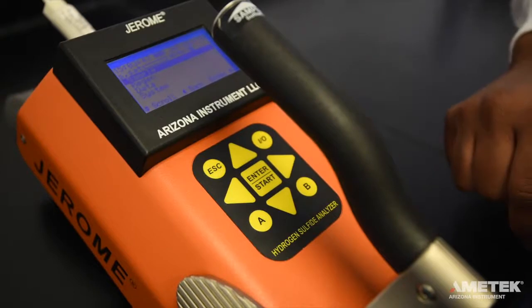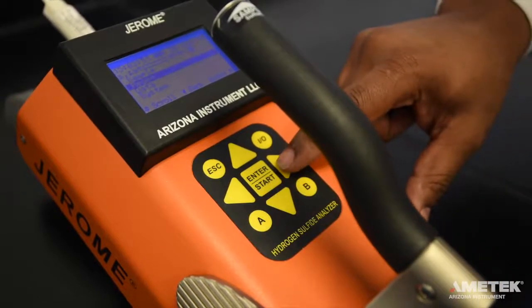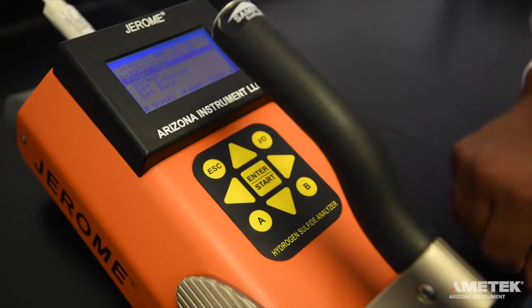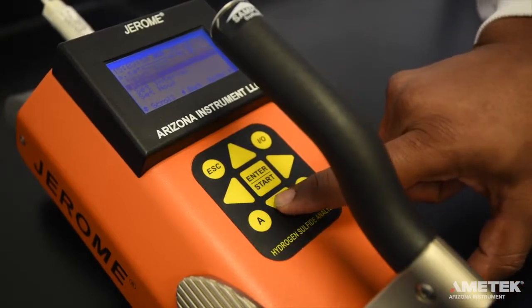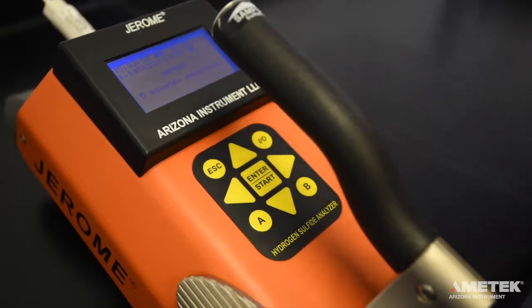Now that you have successfully performed a sensor regeneration and the clean air system check, it is time to take a sample. Please note that for levels less than 10 ppb, it is necessary to run a warm-up routine with the zero air filter before sampling. To do so, install the zero air filter and select warm-up from the regen menu. This will initiate the five-minute warm-up. For levels of 10 ppb and above, the warm-up is not necessary.